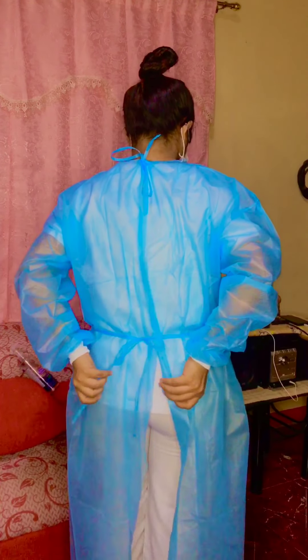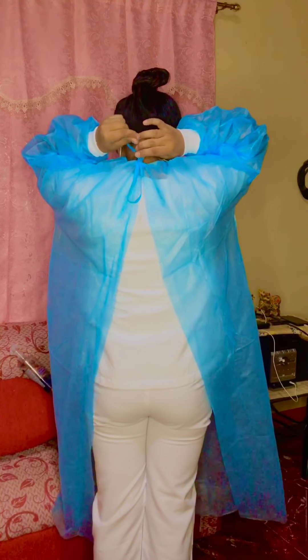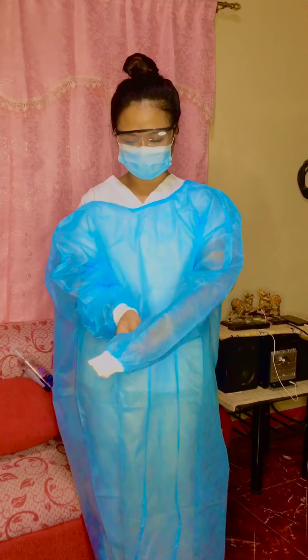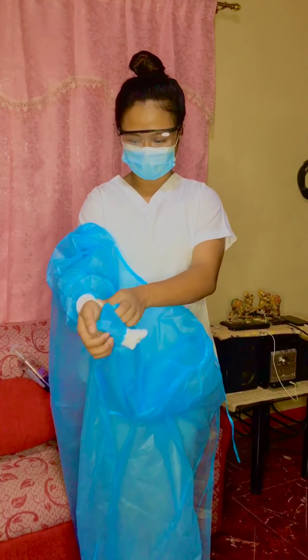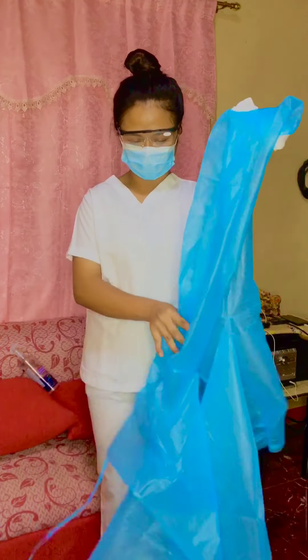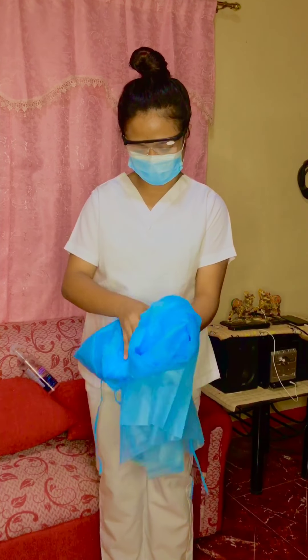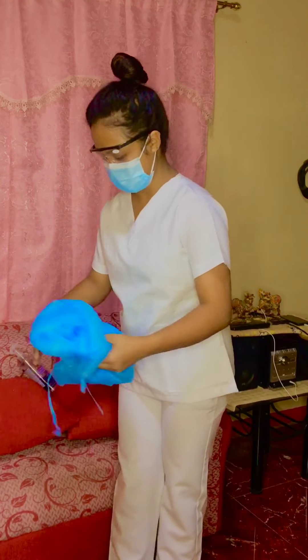Next, remove your gown. Break the ties gently or untie it, avoiding a forceful movement. Reach up to the shoulders and carefully pull or roll the gown down and move it away from the body. Dispose of the used gown.